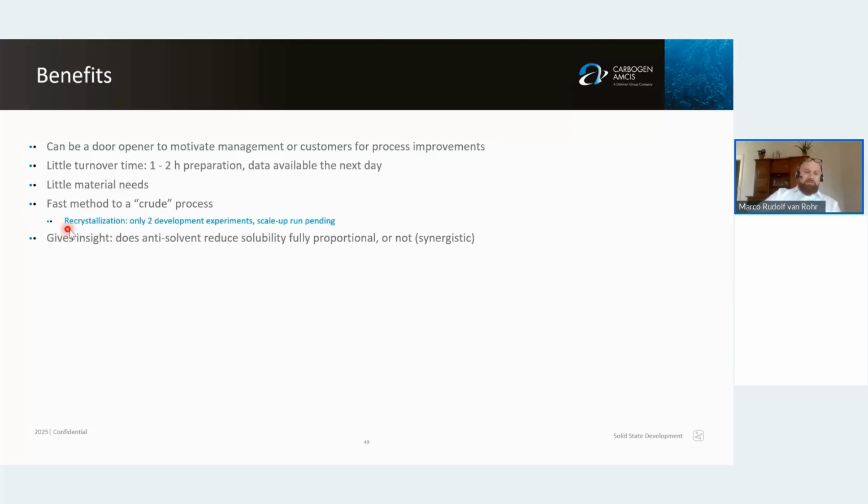So for the recrystallization, I showed we only had 2 development experiments, and now the upscale run is pending, but I don't really expect any surprises. And it can give you insight about whether your anti-solvent reduces your solubility fully proportionally or not. If you have synergistic solubility, that's definitely something you want to know.